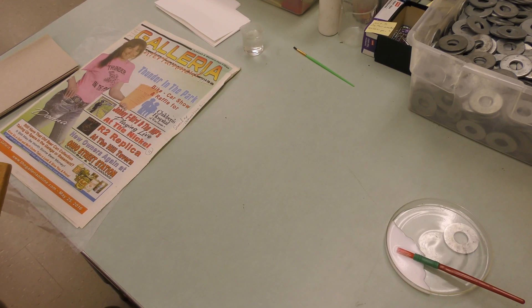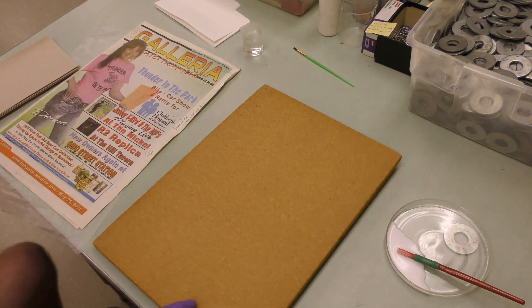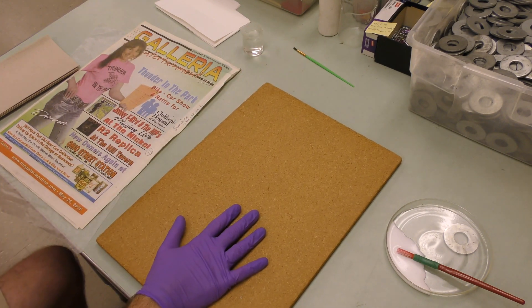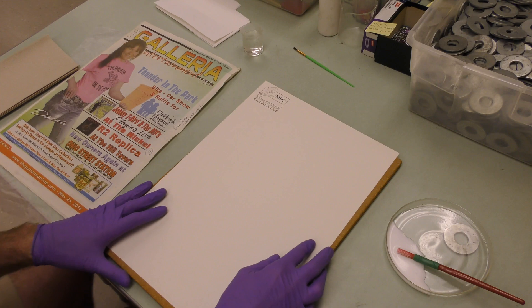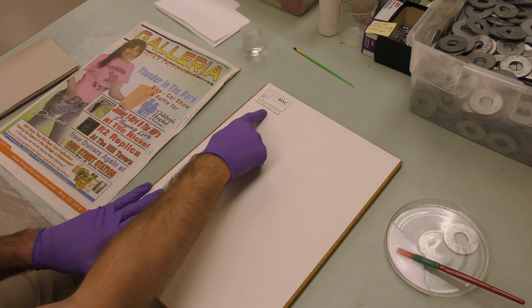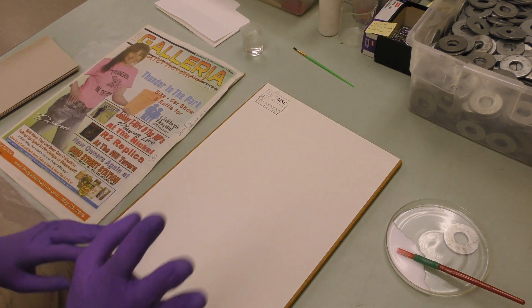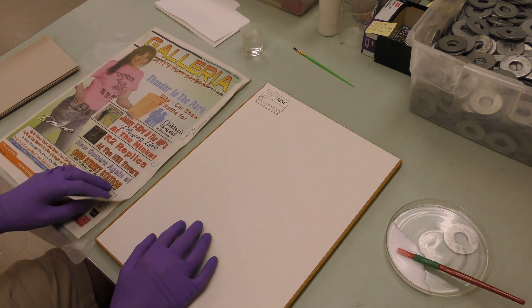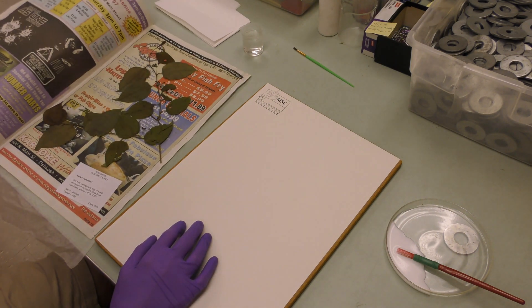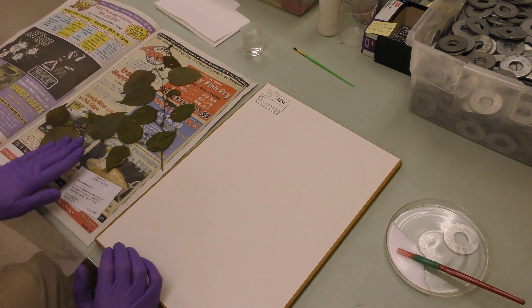I'm ready to get started. The first thing I'm going to do is put down a board here — that lets you move the stack later easily if you need to — and then my sheet of acid-free paper. This is a herbarium sheet. You can see ours actually has our logo up here in the corner. Most sheets don't have that; it's fine if yours doesn't. Then I'm going to open up the unmounted specimen, and you can see that this contains the plant material and the label.